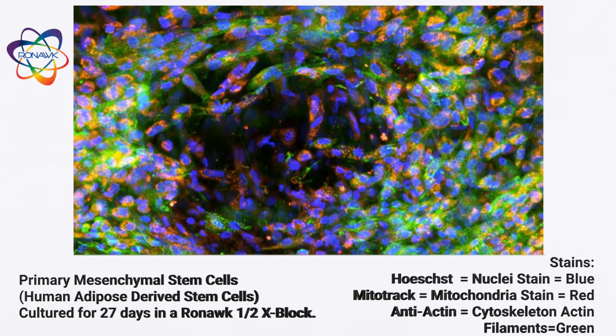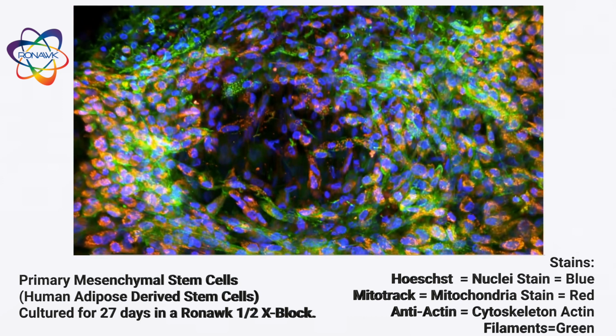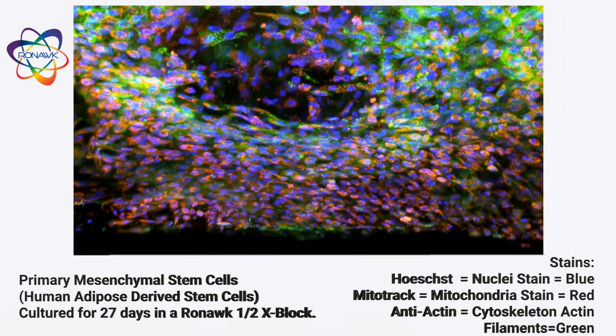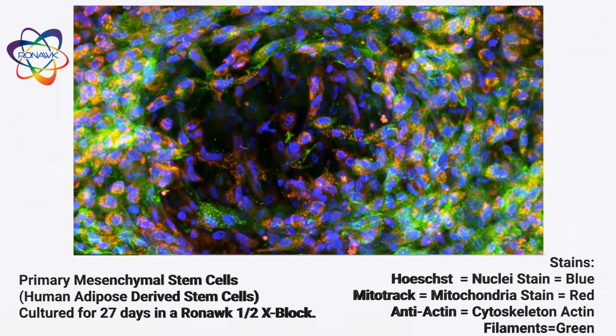This video captures the cells growing on the opposite side from which they are seated, aka the bottom of the bioblock. This shows them organizing around the center pore and infiltrating throughout the block, suggesting we have cells on the top, the bottom, and inside the block.